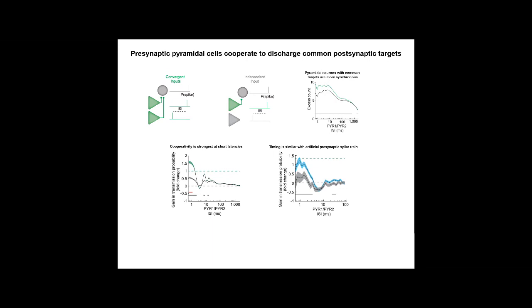We could do these manipulations where we control a small number of cells. And what we actually see, again, gray is spontaneous. This is now both for the convergent. And then when we stimulate, you see the artificial spike train, the evoked spikes, in blue.